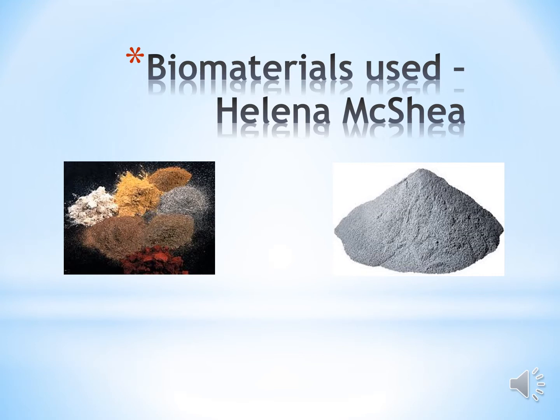When we are selecting a biomaterial to use, the material properties, implant site requirements, and manufacturing technology should all be taken into consideration. The biomaterials used must be printable in nature, meaning they possess printability characteristics, such as rheological properties, biocompatibility, such as no cytotoxicity or immunogenicity, and the possession of appropriate structural and biomechanical properties. I will be talking about the main biomaterials that are used to bioprint cells, tissues, and organs. The various technologies used in 3D printing are chosen according to their intended function.